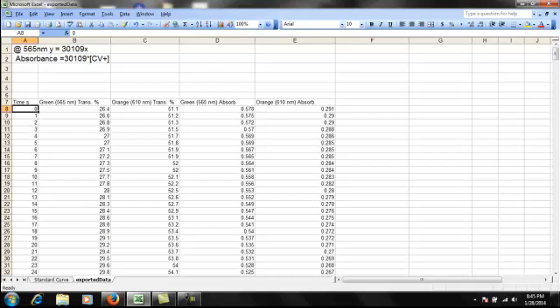This data was actually acquired using an iPad where it measured the sample rate once every second. You're not going to be able to do that. You're actually going to measure it manually. We'll talk about that tomorrow.